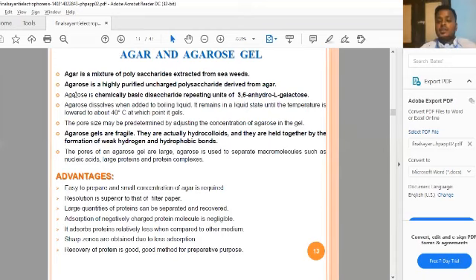One of the factors affecting electrophoresis is temperature, along with the porous supporting media, pH, and temperature. These factors must be correctly maintained, otherwise your electrophoresis samples will be affected. The factors are temperature, pH, supporting media, agarose size, and your buffer solution. These are the factors affecting your electrophoresis samples.